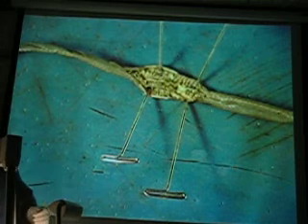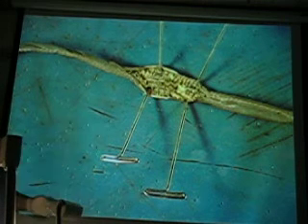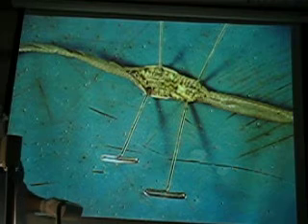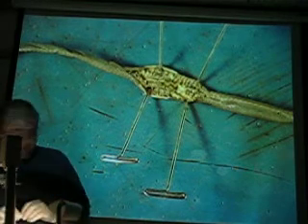Extreme close-up. That's good. Is that alright? It's kind of focusing in and out. You see it can't quite find where it wants to go. Or maybe it's just me. Maybe it's strong.